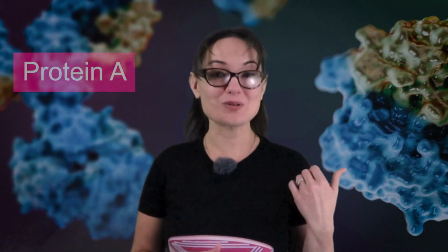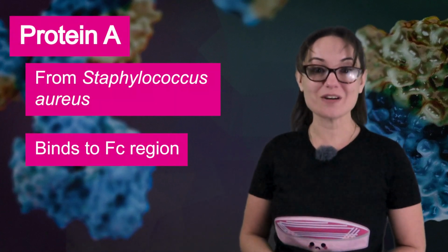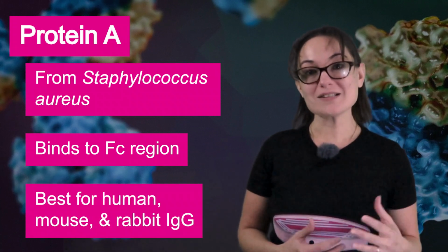Okay, so now let's move into the affinity proteins. For antibodies, there are 3 common affinity proteins: protein A, protein G, and protein L. Protein A comes from the bacterium Staphylococcus aureus and binds to the constant region of antibodies. It's particularly useful for purifying IgG antibodies from human, mice, and rabbits.